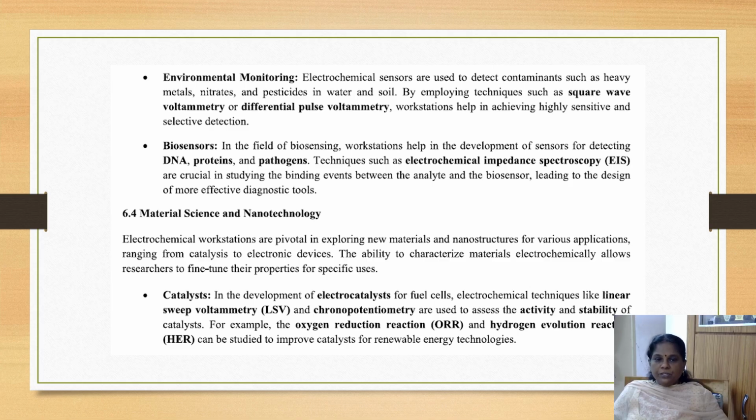And the fourth application is material science and nanotechnology. Electrochemical workstations are pivotal in exploring new materials and new nanostructures for various applications, ranging from catalysis to electronic devices. The ability to characterize materials electrochemically allows researchers to fine-tune their properties, that is, we can tailor the properties of the material by characterizing it with the electrochemical workstation.